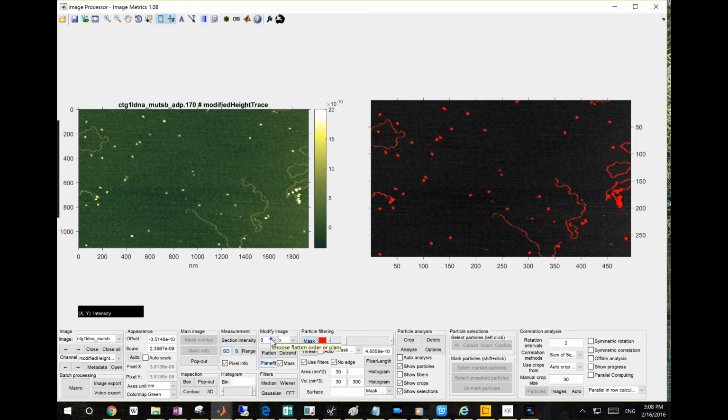Just click the plane fit button. You can specify some parameters here, but because plane fit is doing a two-dimensional fit, you can fit both the x direction and the y direction. So just click plane fit, and it asks you for the specific orders. Right now I can use first order in y and second order in x. That seems to describe the surface well. Just click OK, and you should finish this plane fit. Right now it's finished, so you get a new modified channel there.